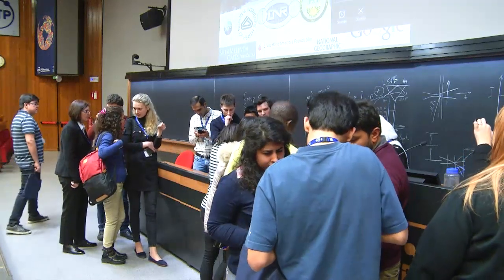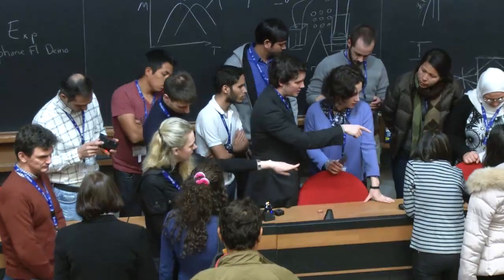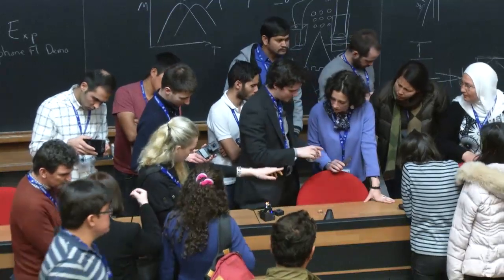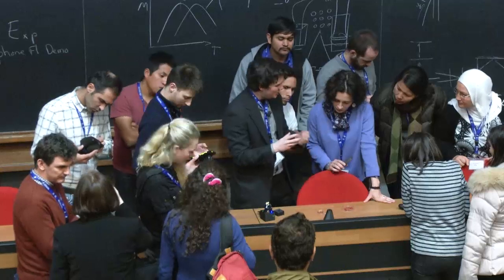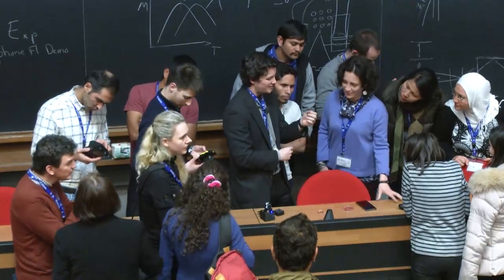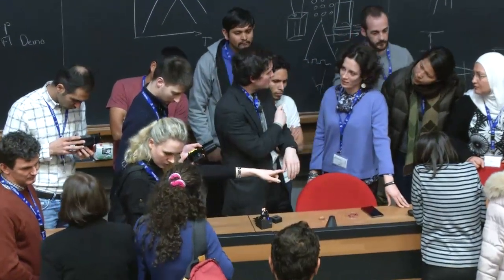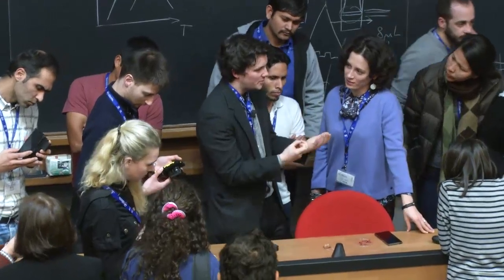And there's the flexible ones, I think, over there. So I have some I've made on a flexible substrate. So the idea, the dream here, is that you can make these, put them on a Band-Aid and put them on someone's arm, and it can measure an analyte in sweat or something like this.